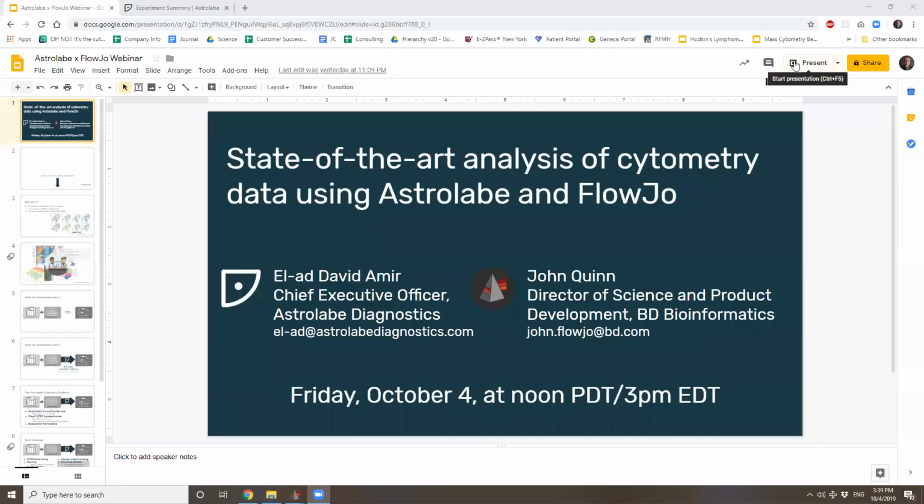Yes, so welcome. Would you like to spend a minute to introduce yourself? Sure. Hi. For those of you who don't know me, and I see a few familiar names on the list, I'm John Quinn, the Director of Science and Product Development for FlowJo. Including teaching how to use FlowJo, it's also my job to help decide what features should be included and where the program should go. It is fair to write me at the email address listed there, john.flowjo@bd.com, with any requests for inclusions or anything that we're not doing well enough. I am the FlowJo guy, and that's probably just enough.